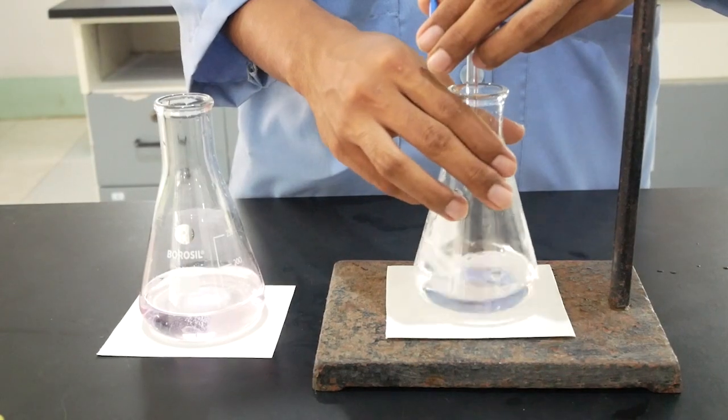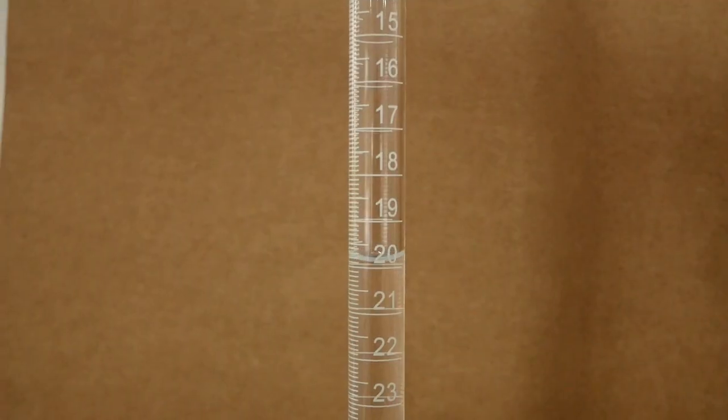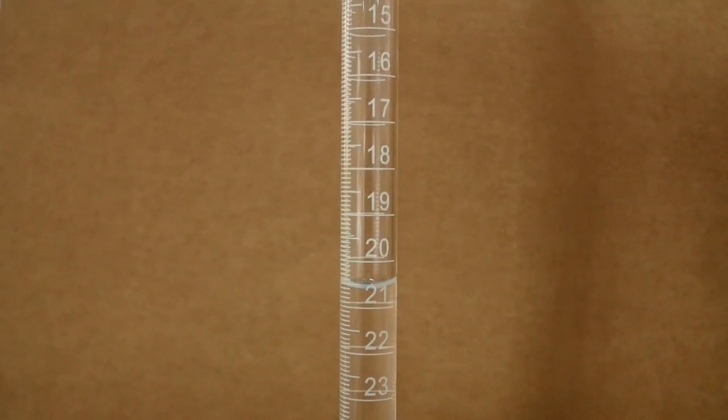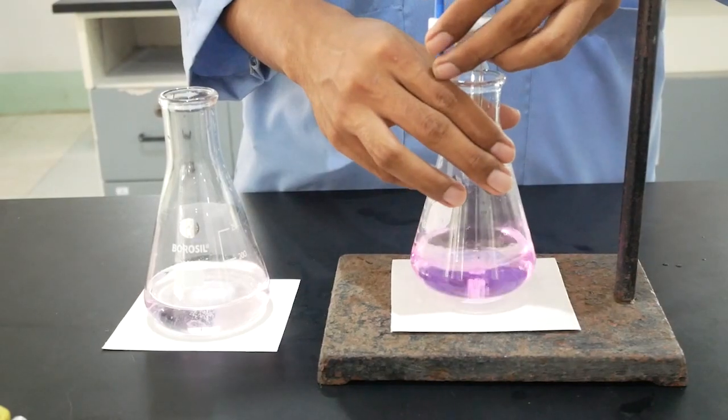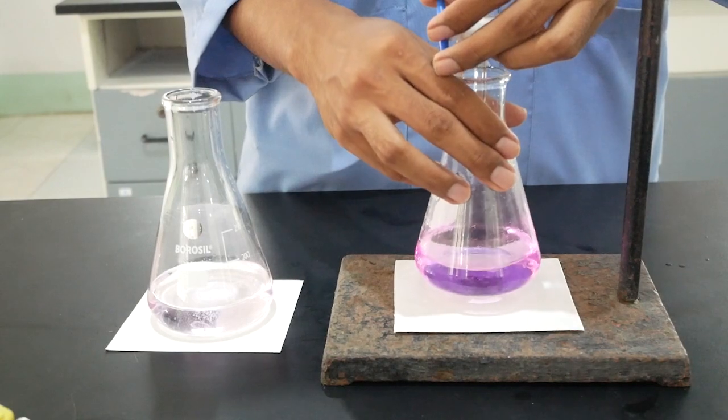Continued addition of titrant after the endpoint has been reached will result in a darker pink color in the analyte which must be avoided, as this color indicates that the pH of the solution is already above the equivalence point for the reaction.